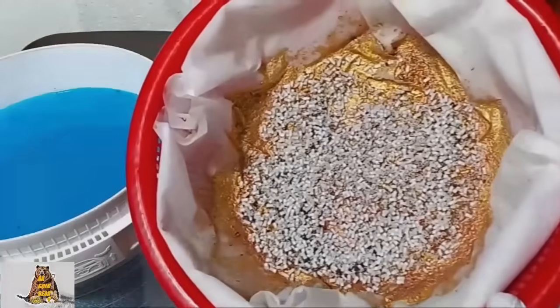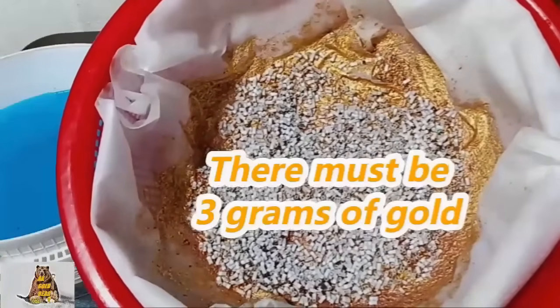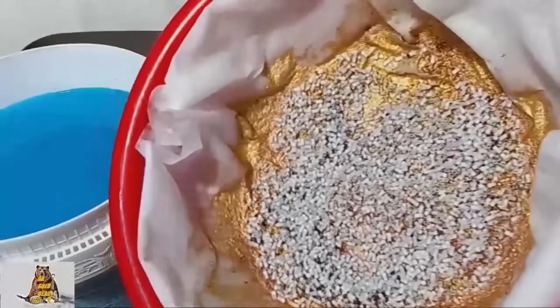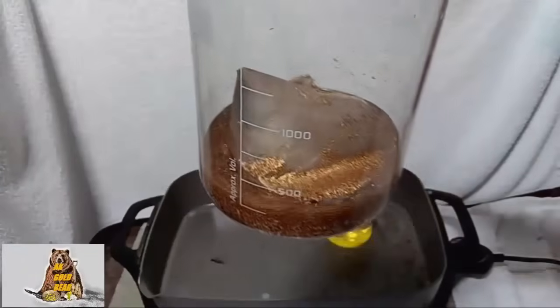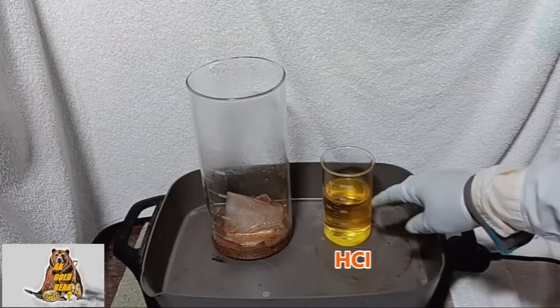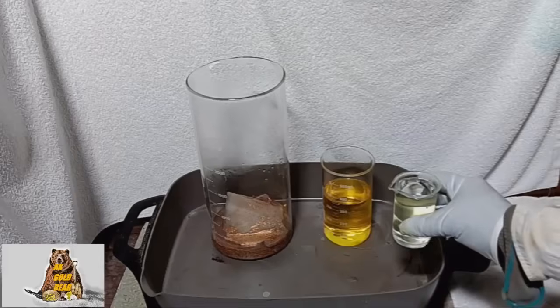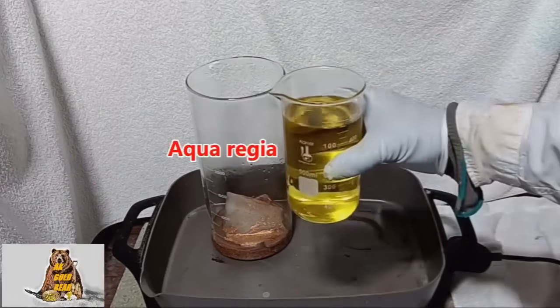I collected all gold flakes on the filter. There are a lot of plastic here, which is no problem. Now I'm going to dissolve all the gold flakes in aqua regia. Gold flakes in the beaker. This is my old hydrochloric acid from the waste container — I want to use it again. Nitric acid — aqua regia.